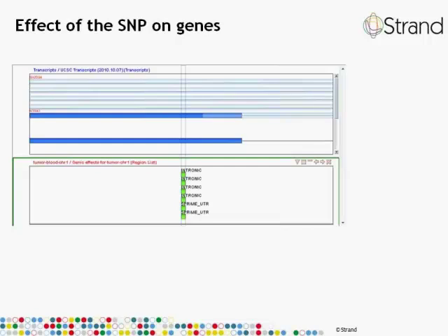After you have filtered down a list of SNPs based upon your biological criteria of interest, such as chromosome and zygosity, you can investigate all the genes which harbor these SNPs. If you want to know, for example, all the genes on chromosome 1 that are affected by homozygous SNPs in the tumor sample, you can click this filtered SNP list and select the SNP Effect button in the workflow. Typically, if you have multiple unrelated patients, you can now compare gene lists generated from each patient within experiments. Interesting genes would be those that repeatedly appear to harbor mutations in various patients.